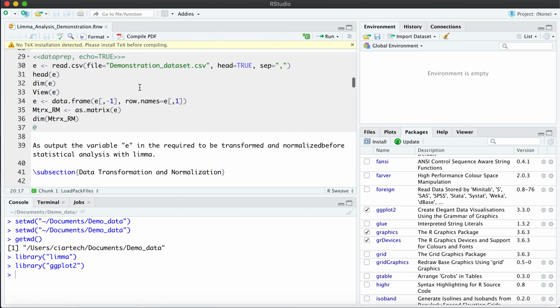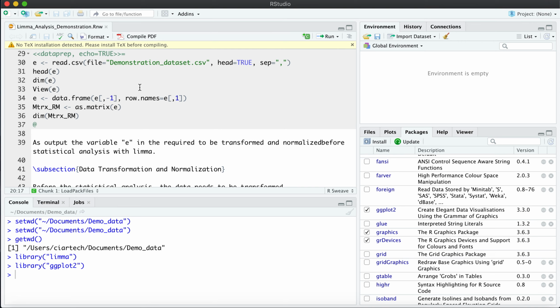So after we set our working directory, we load our packages. You see a pattern up to this point. First we set our environment, then we load the packages, and then we set our dataset. Those are the three main core components before doing anything else in R, in every analysis, but specifically for R. So this line over here is the dataset.